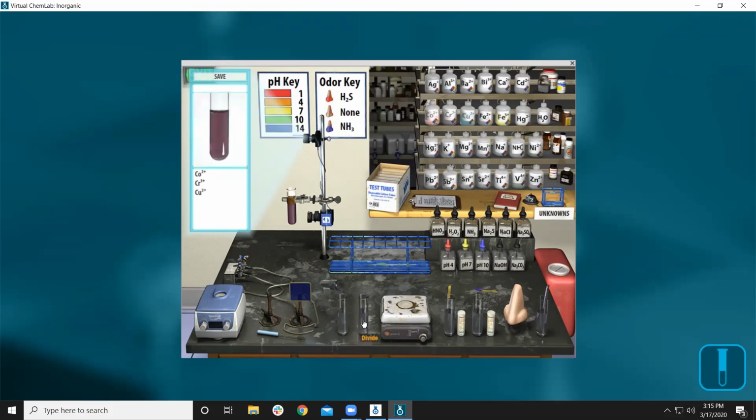And then decant, divide, heat it up, you apply heat to it, and then you have pH of the solution, pH of the vapor, smell, stir it up, and then you have these 11 reagents that you can add. Any order, any combination. So you have 25 cations plus water, and these 11 reagents with heat and all these things, and so you have about 10 to the 26 real outcomes. So all of these outcomes were measured. Obviously, we didn't do 10 to the 26. That would take a long time.